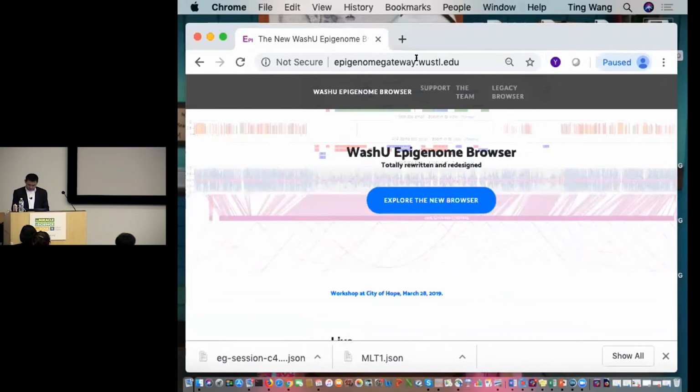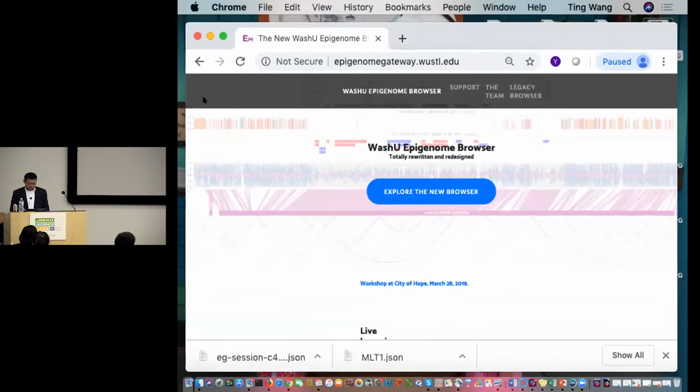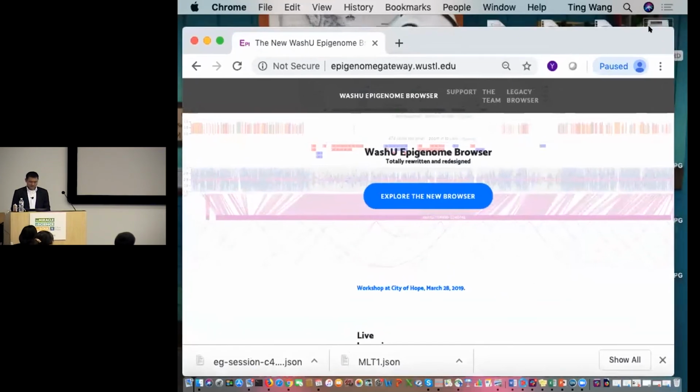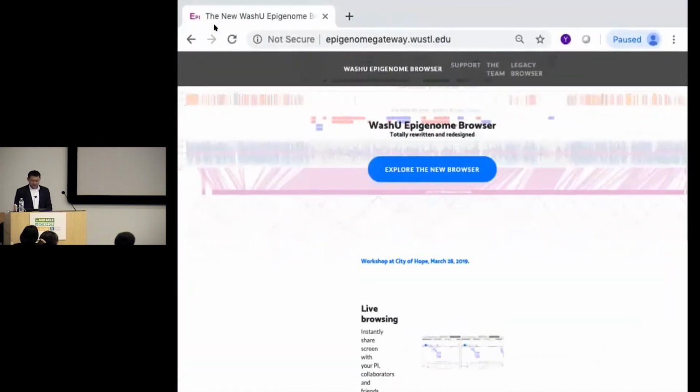Let me see if I can make it smaller. Sorry, just because of this Zoom, we are, oh, come on, go away. All right, we'll just, okay, so a little bit better. So this is our main website, okay? Just quickly, a few things.